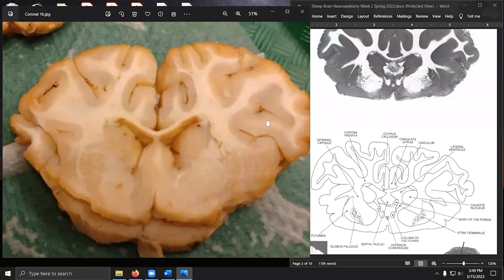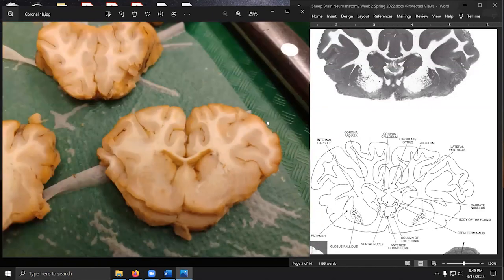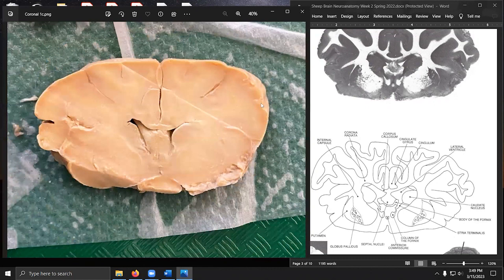So then we go to the next one. If we had a poor quality section, we could still make out some features. So this is one of the sections that came from a brain that was compressed during shipment, but we could still see some notable features. For instance, we can see the anterior commissure very faintly here. I believe the column of the fornix is this thing here that's sort of a different color. We definitely have caudate, lateral ventricle, corpus callosum, septal nuclei, they're all in the same place that they should be.